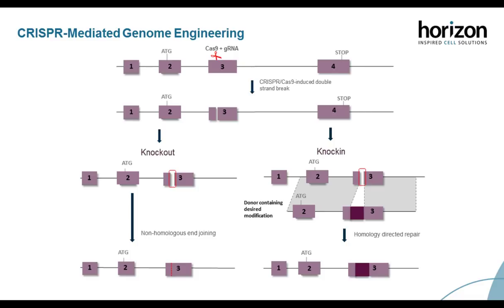This donor has high homology to our cut DNA, and as well as this, it contains the desired mutations, such as a single point mutation or a tag. The cell then uses this donor to repair its DNA and to fix the DNA double-strand break. Because it's used this donor, it also allows for the incorporation of the desired mutations in this process. So because the donor contains these mutated regions, it incorporates these mutated regions into that fixed strand of DNA. And that's essentially how CRISPR works.